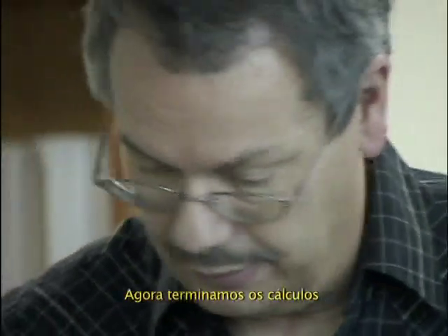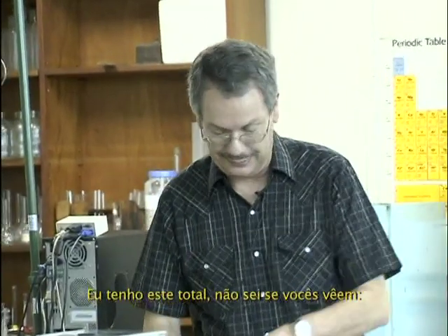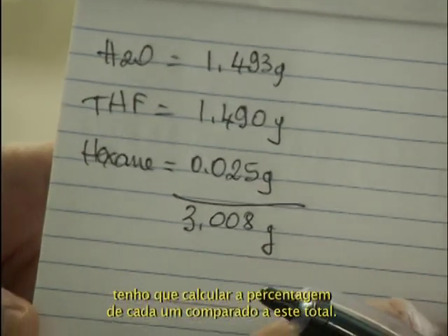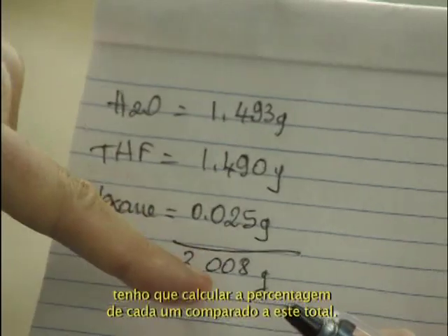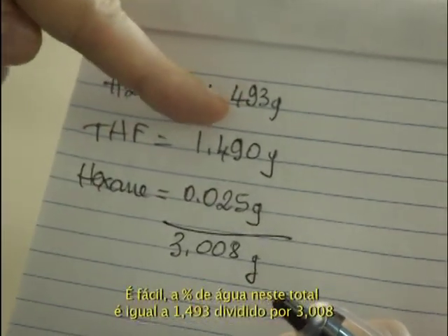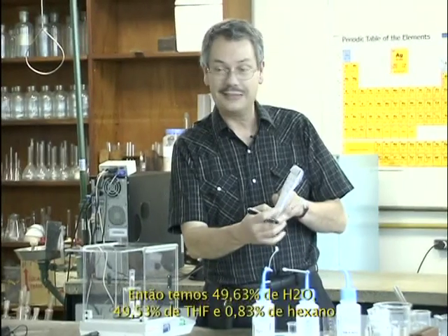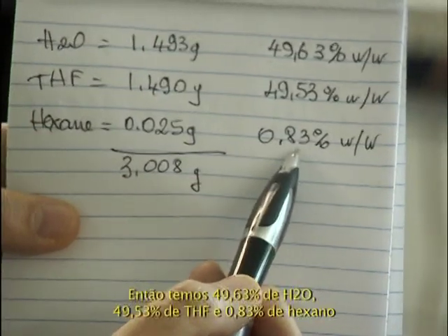So now we finish the calculation. Okay, now I have this total, I don't know if you see it. I have to calculate the percentage of each compared to this total. It's really easy. The percentage of water in 3.008 gram is 1.493 divided by 3.008. So you see 49.6, 49.53, 0.83.